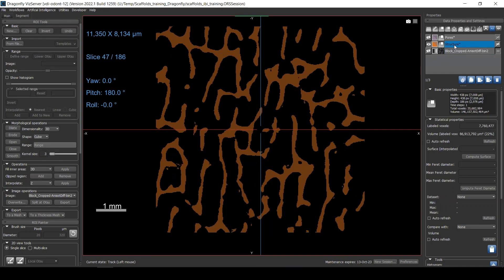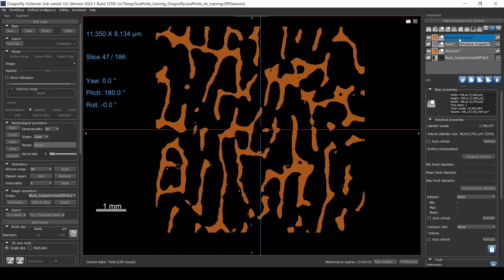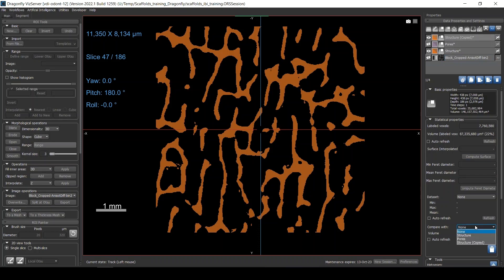One way to do this in Dragonfly is to duplicate the pore region. I'll take the duplicated copy, go to Operations on the Segment tab, and use Fill — doing it in 3D will fill any totally closed pore space. I'll apply that, and then compare this filled version to the original. Refreshing shows 100%, which could mean there are no closed pores — that's good.